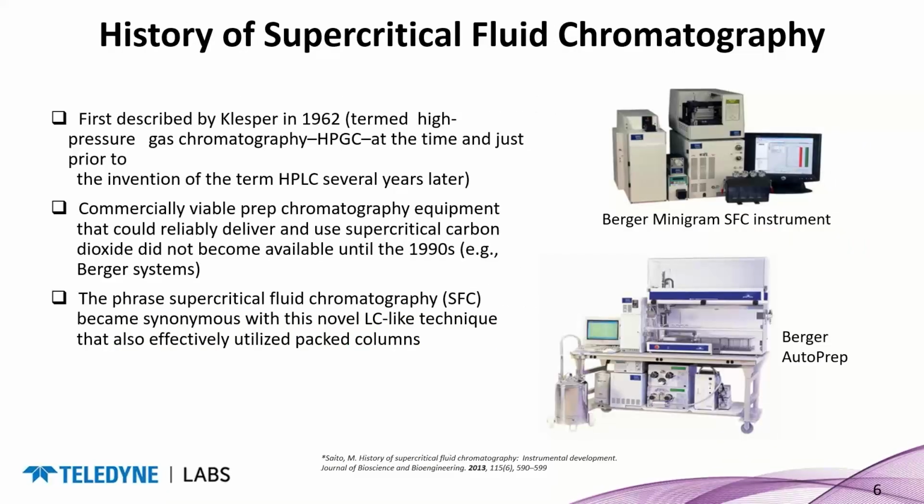So let's jump into the topic of supercritical fluid chromatography, or SFC for short. It was first described by Klesper back in 1962, and it was given a different name at that time, and it was really being viewed more as a gas chromatography technique under high pressure.